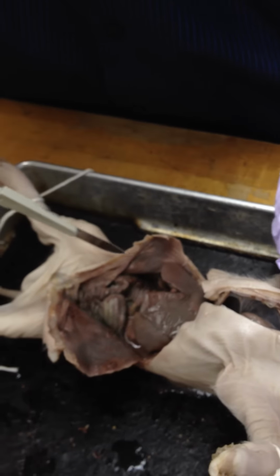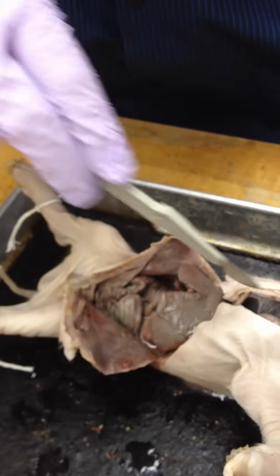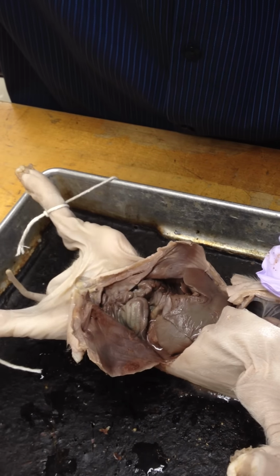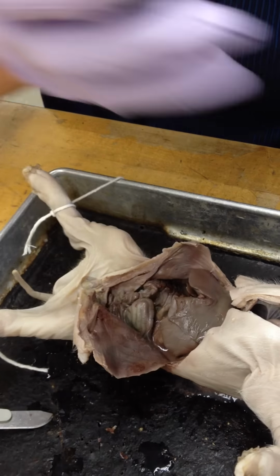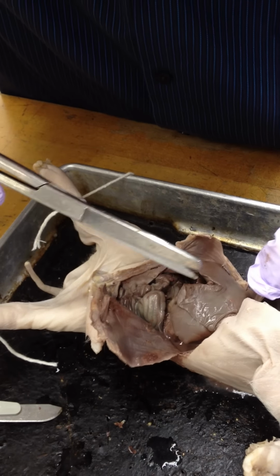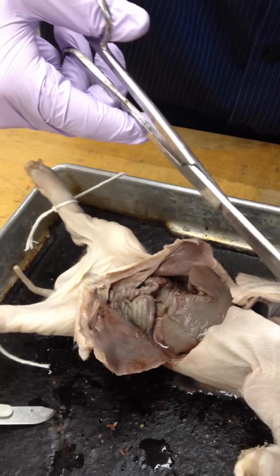You're supposed to use scissors. I was cutting it with the scalpel. Scissors would probably be good. So why don't you try cutting the flesh with these and see how well it works? Is this how you do it though, Bill? Yeah, like you go like that and open it up in here. I want to get this rib cage open a bit more.